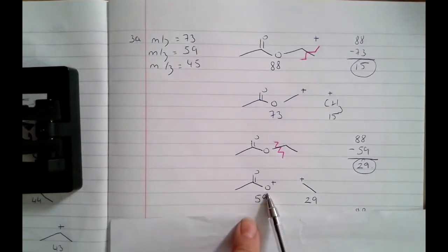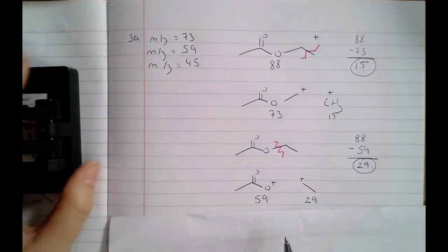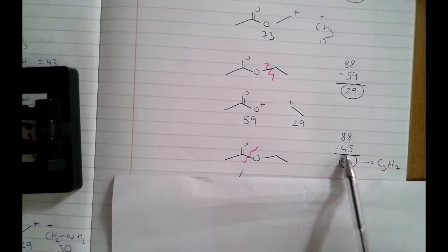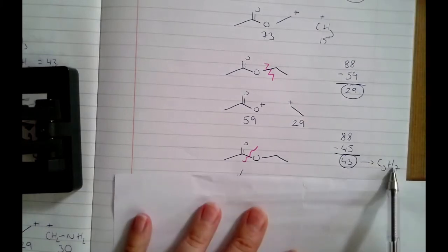If I do that, the fragment that I'm left with has a mass of 59, which is the peak that I asked you about. The last bit, 45, again, not a number that we're familiar with, so we're going to apply the same approach. If I were to have a peak at 45, then I must have lost 43. Now, 43 is a number we've come across, and it's typically caused by a C3H7, so a propyl group, 3 carbons, 7 hydrogens.